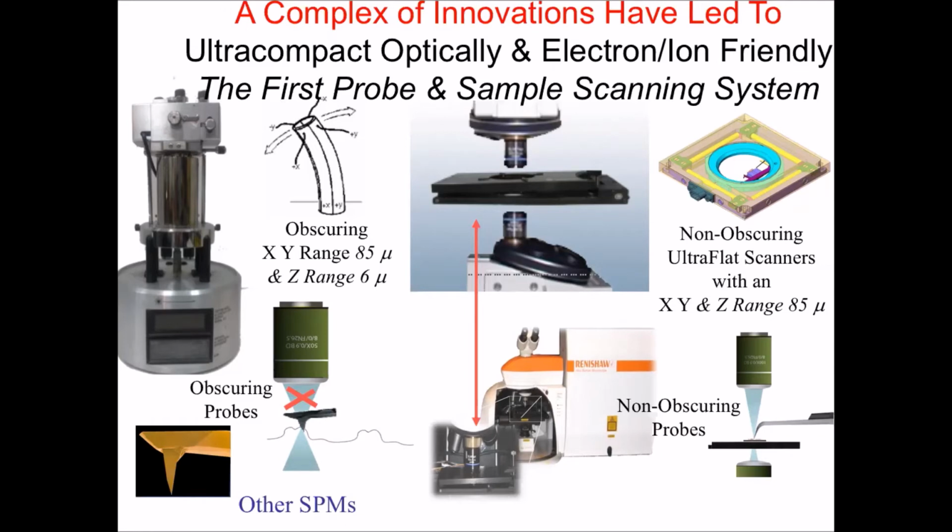In fact, I know you are experts, and I feel terrible saying this, but I believe we were one of the first people to make a flexure scanner in the world, I think. I'm not sure. Nir can correct me if I'm wrong. But what we did was we took these piezos and placed them as a quadrant of 4. So what was a Z, which was only very little when you stretch a piezo, here the Z was the same as the X and Y. So this type of scanner has X, Y, and Z exactly the same, and the Z can have ranges of many tens of microns.